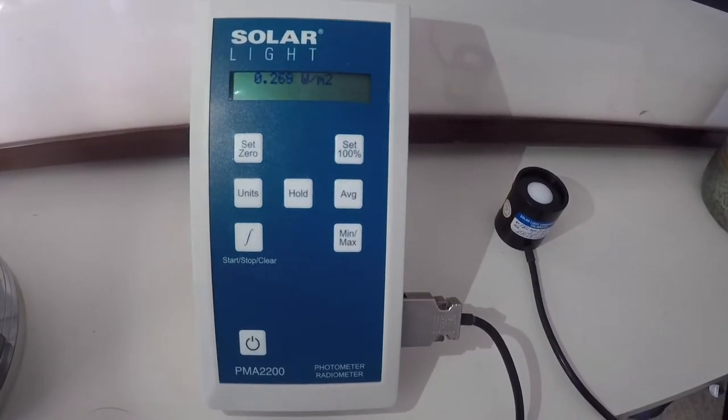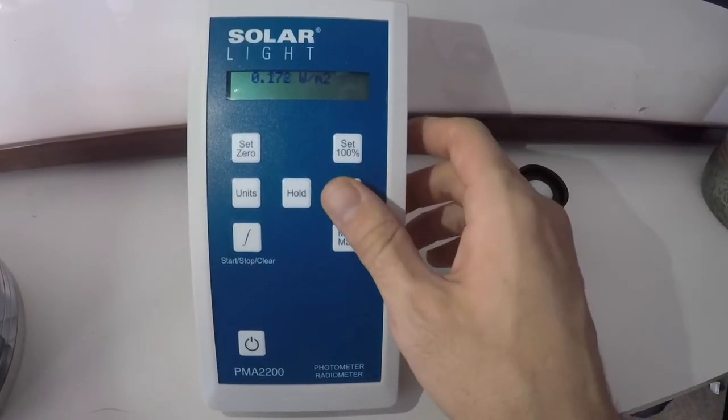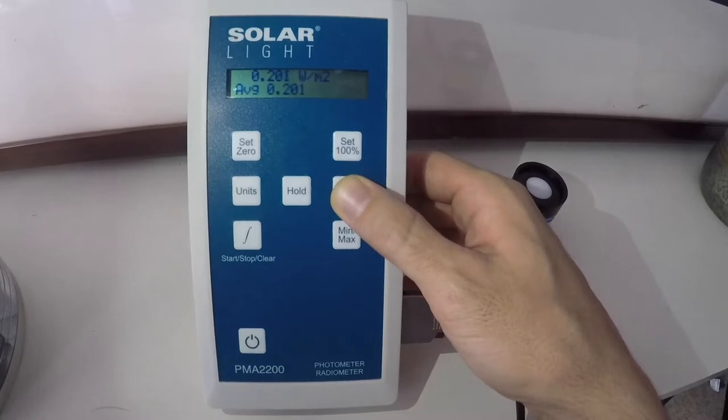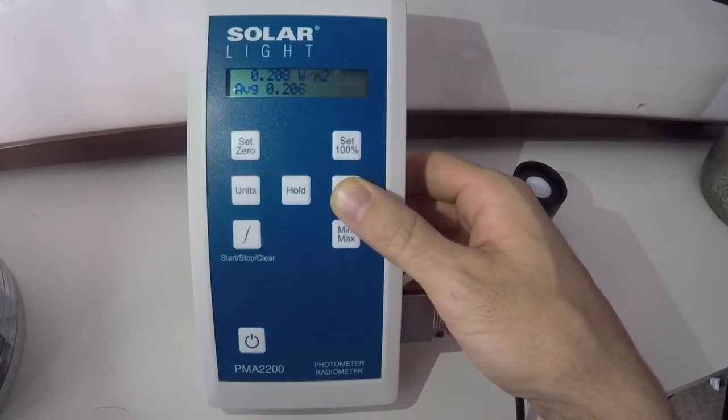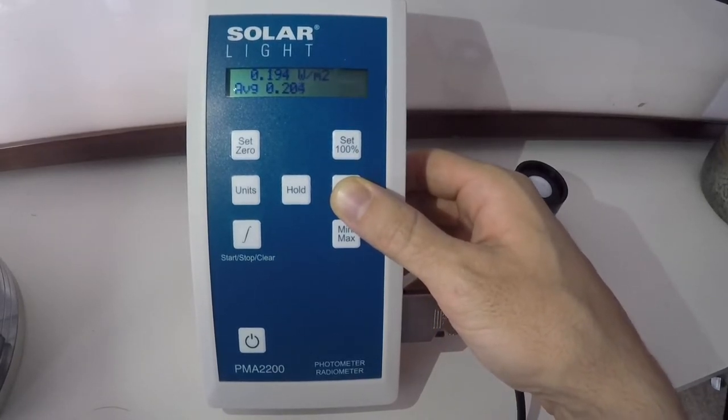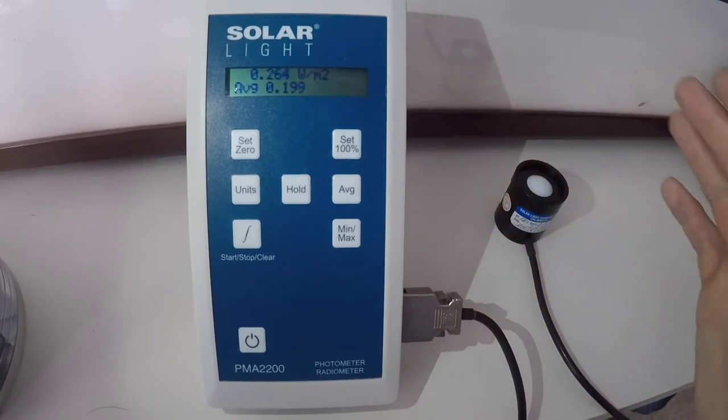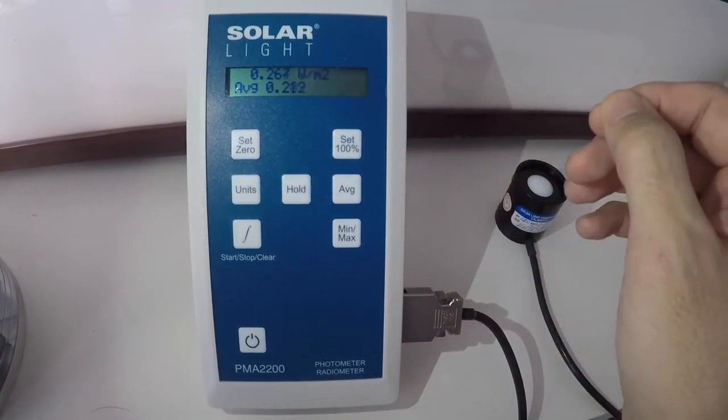Let's look at some additional features that we have. Average is just as it says. We can press the button and we can get the average reading over a time period, which can help a lot of people if they are stumbling over getting numbers that are jumping around too much.